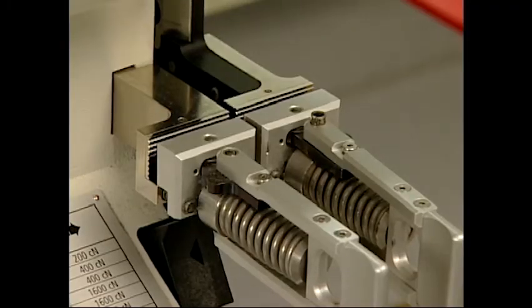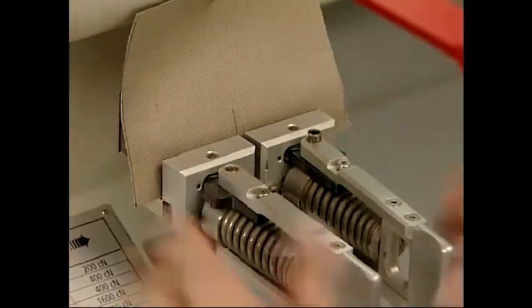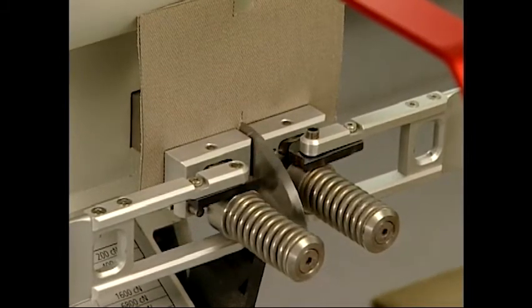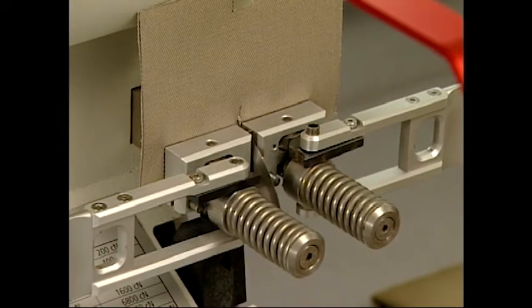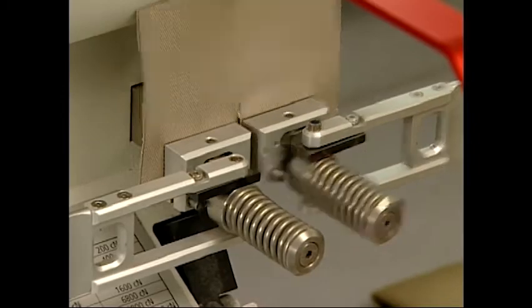The tester makes use of a stationary clamp and a clamp mounted on a pendulum that is free to swing away from the fixed clamp. After the specimen is clamped in the tester, the slit is cut. The pendulum is activated and the two clamps move in opposite directions, tearing the specimen through the fixed distance of the sample.